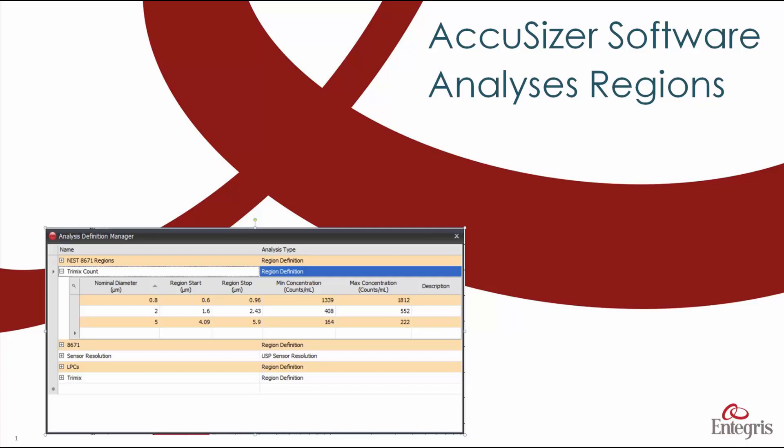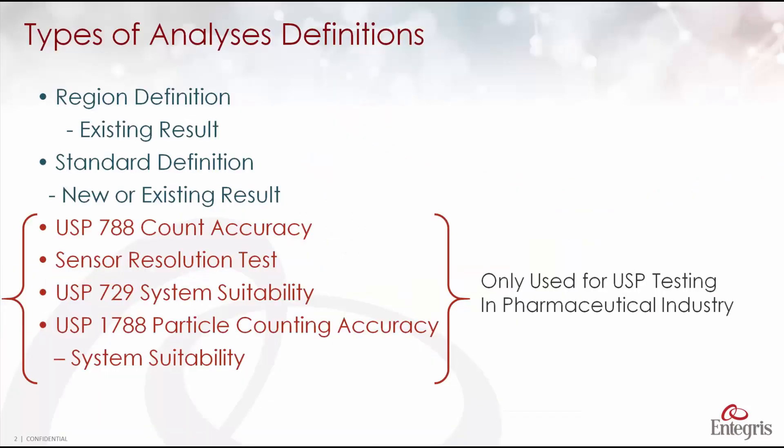This is AccuSizer software training on analyses regions and how to use the analysis definition manager. There are six types of analyses definitions in the AccuSizer software.